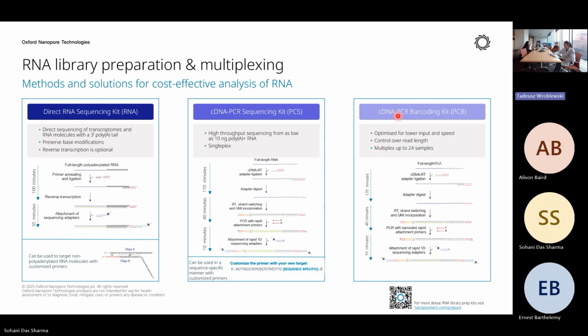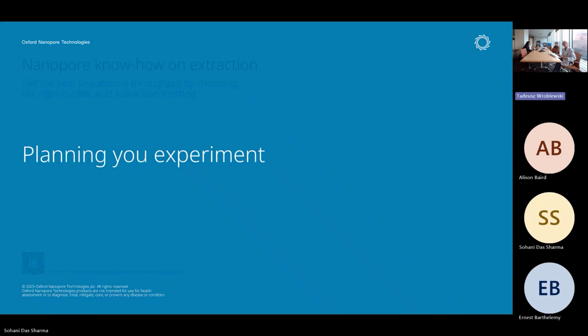But for small RNA, let me do some internal research, because I think the issue is polyadenylation, based on my experience from all the ribosome profiling I have done in the past. We used to do it using template switching, using Takara. That is probably the best way to do that. But for Nanopore, I need to check if some lab has already optimized anything for microRNA, then we can talk more. We do not have any present benchmarking data.